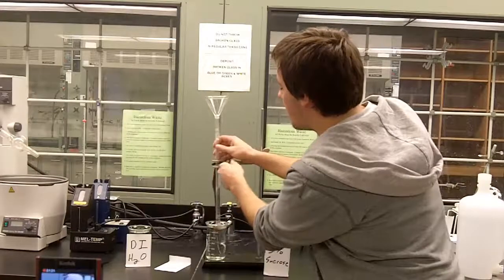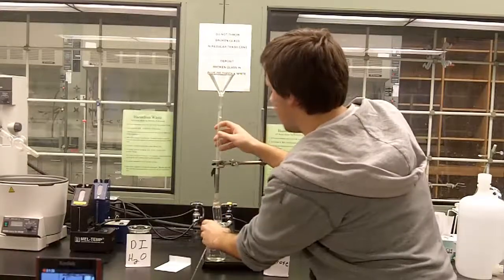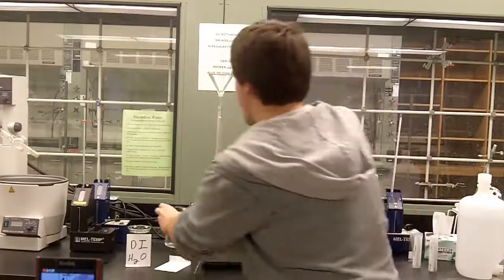Alright, so next we're going to stick it in the distilled water, which has no sucrose in it. Try to predict which way the water should move.